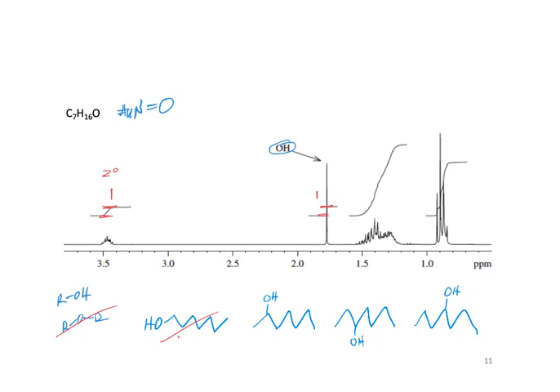forest at 1.5, it means that there's a lot of distinct signals, and if it was symmetrical, you'd be able to resolve some of it. Yeah, so this is symmetrical, so likely it's not that. I agree, because it looks like our spectrum is more complicated than that. So we'll take that out. We probably don't have a bunch of branching either. It looks like we have a bunch of CH2 groups in here.